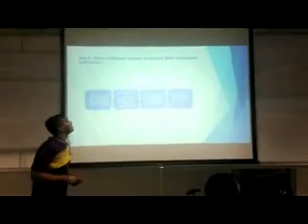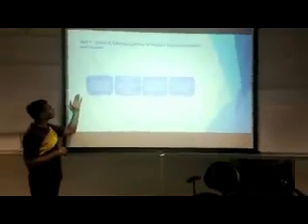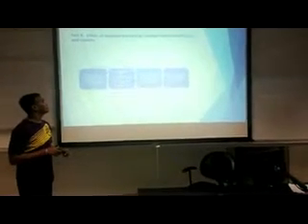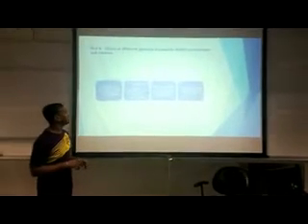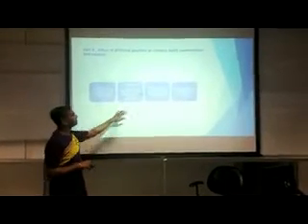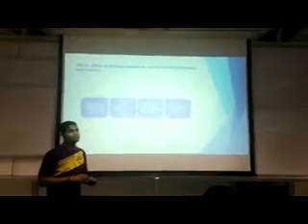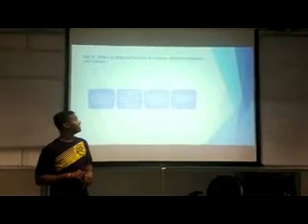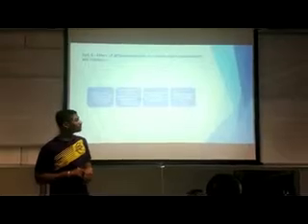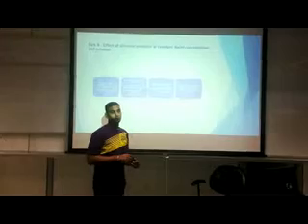Part B is the effect of different pressures at constant NaOH concentration and rotation. As in the previous experiment, NaOH solution is prepared by adding 50 grams of NaOH into 100 ml of water, and the solution is weighed. Set the parameters as follows: water bath temperature again 100 degrees Celsius, vacuum pressure 90 millibar, rotation 60 rpm. Run the process for 30 minutes and then measure the refractive index and weight of the liquid and vapor. Repeat the experiment with 150 millibar and 200 millibar of vacuum pressure.